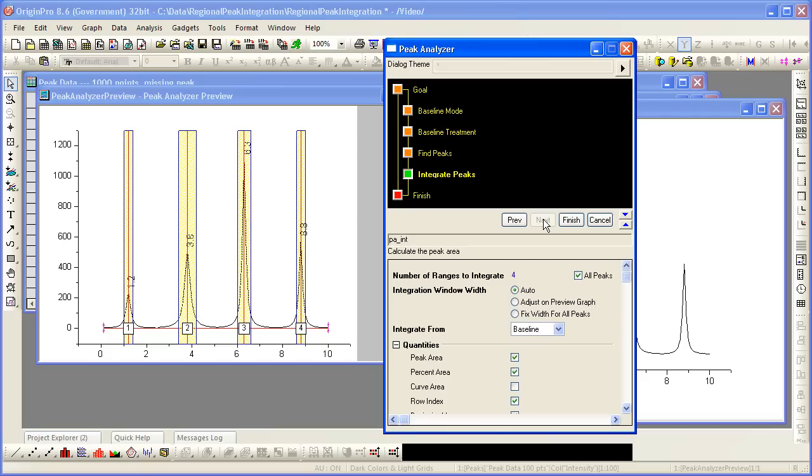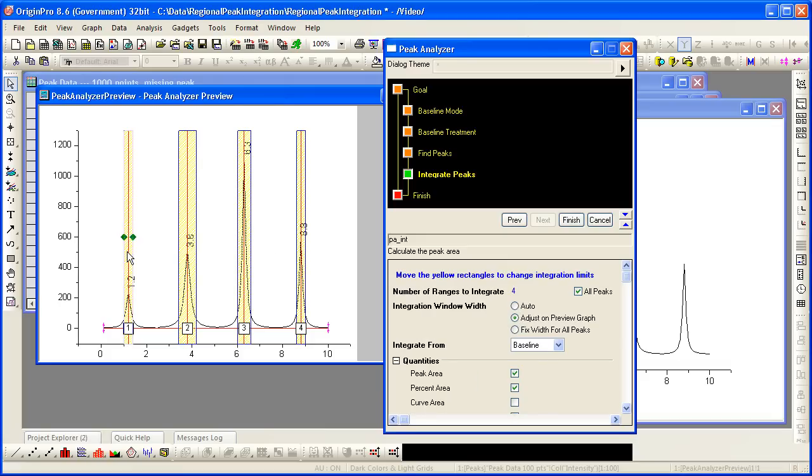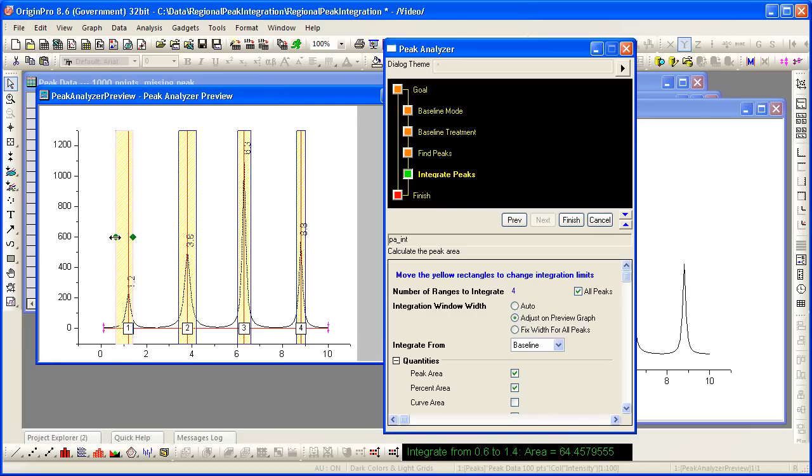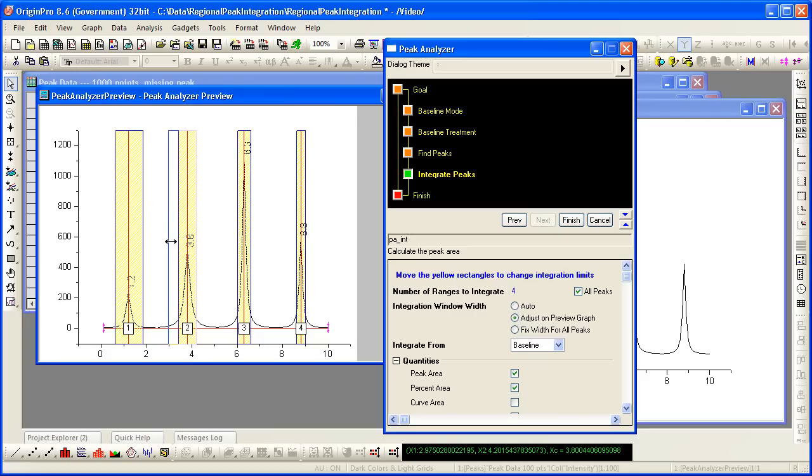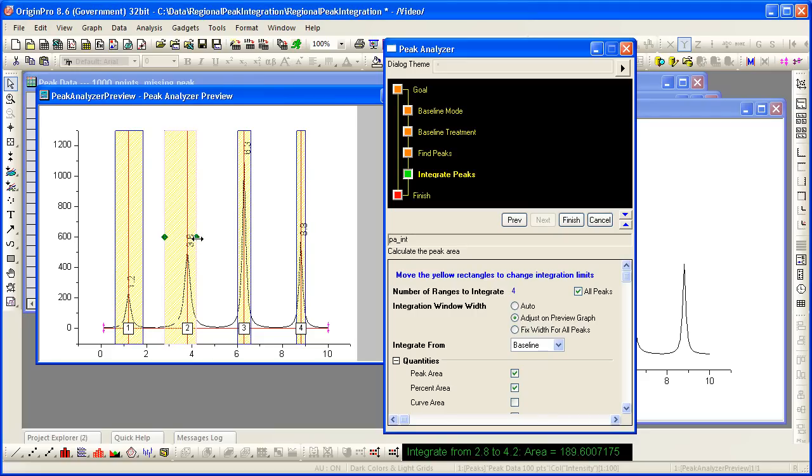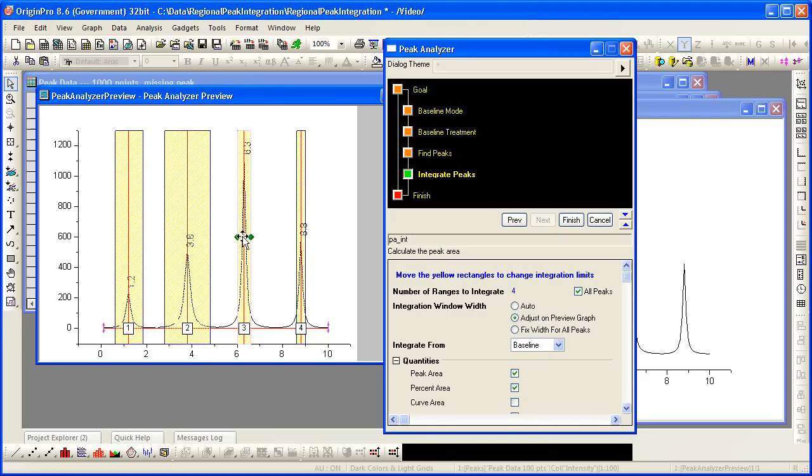On the final page where the integration options are listed, it is also important to select one of the second two options as you do not want origin to try to rescale the integration window either. You want to be able to set this or have a fixed width before moving on and saving your options as a theme.